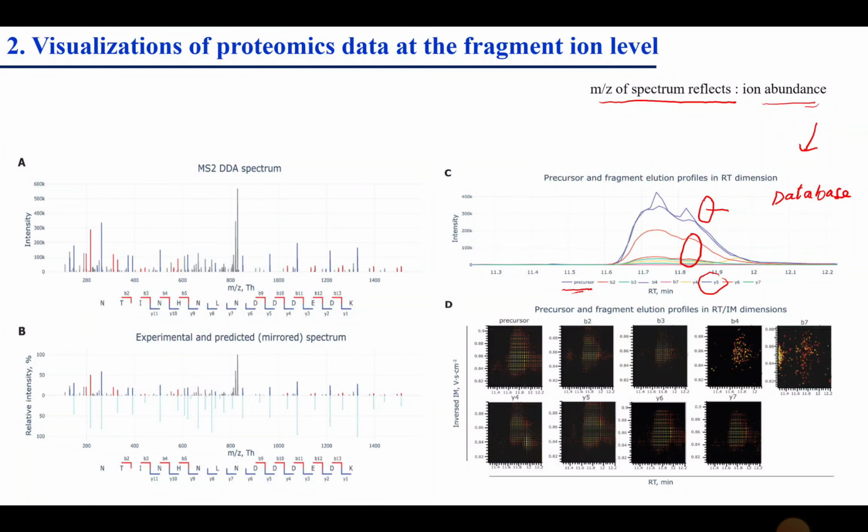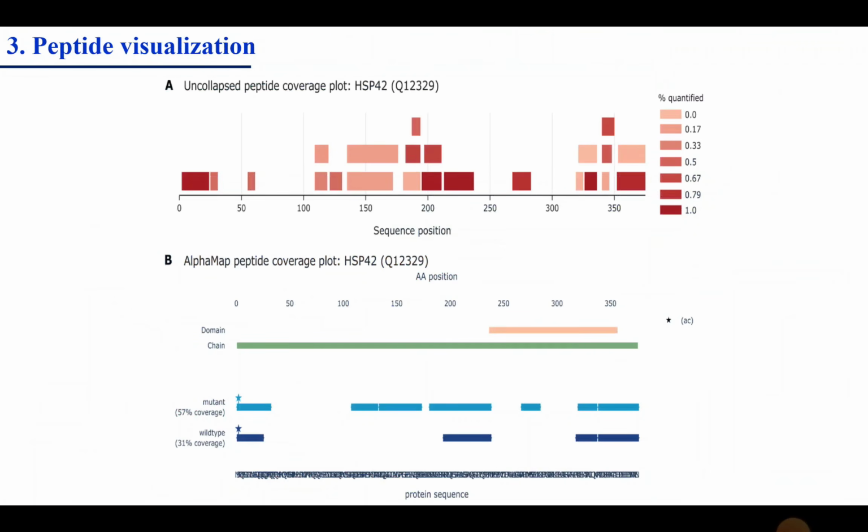What we do actually, we change these profiles into their amino acid sequence, and we compare them with the help of online databases of protein sequences, which is achieved through the decoy. With the help of deploying these decoys to these modification profiles, we can keep a few important precursors and we can discard the remaining ones.